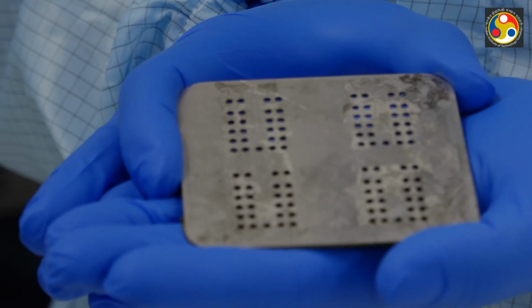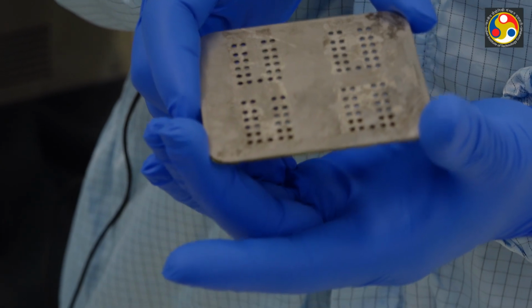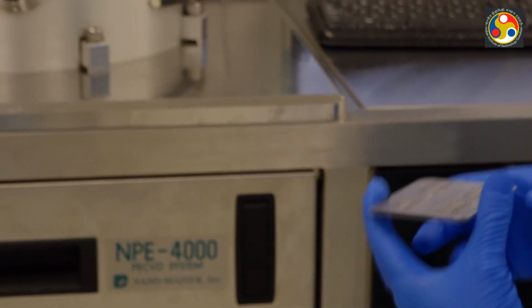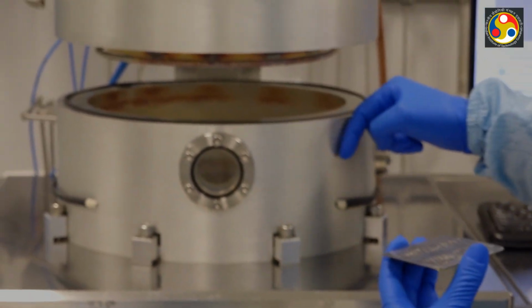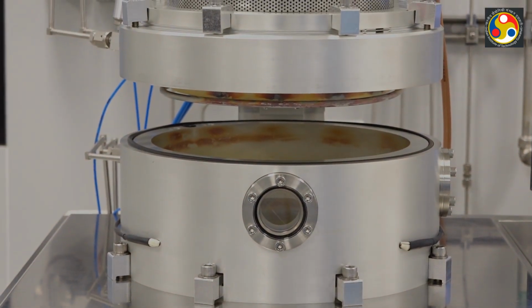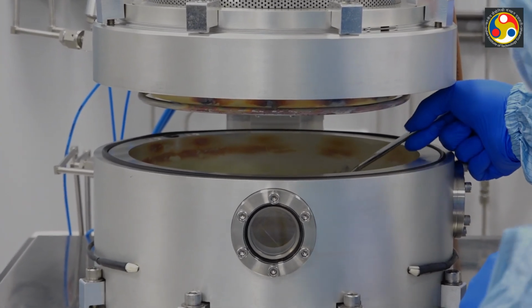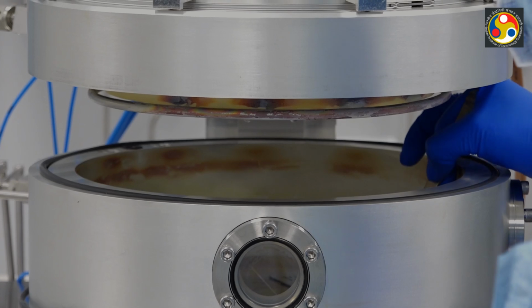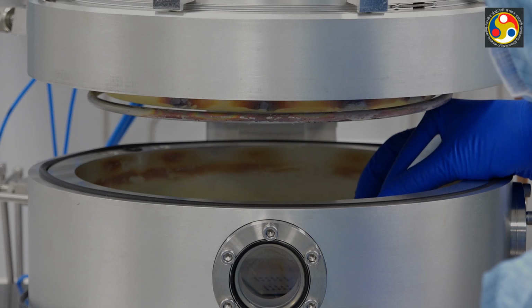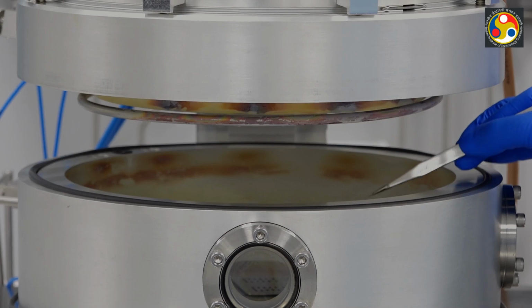So as I have told you before, this is our sample which is kept at the back, and this is the metal grid. We are going to keep this inside our chamber. So the wall as well as the platen is quite heated, so I am going to use a tweezer, and very slowly and carefully I am going to put it inside the chamber. So my sample is at the platen, exactly at the middle.